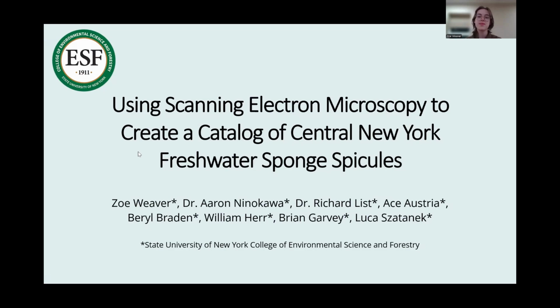Hello, my name is Zoe Weaver, and I will be sharing with you our work towards creating a catalog of Central New York's freshwater sponge species and their spicules.